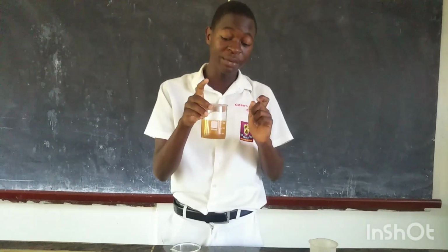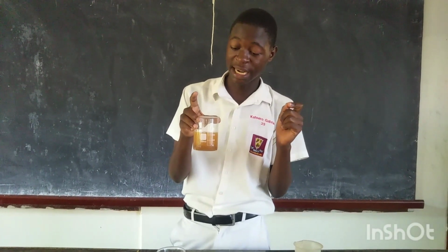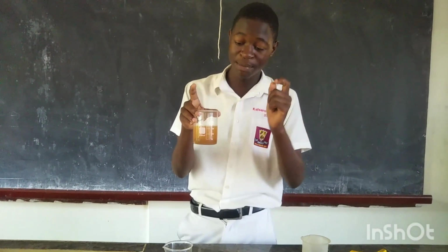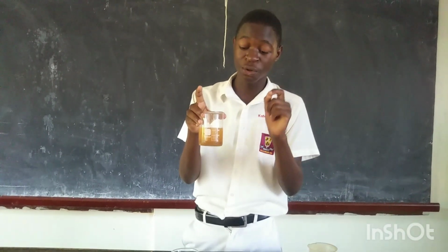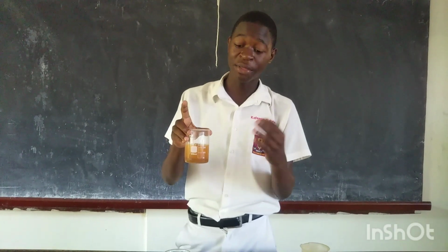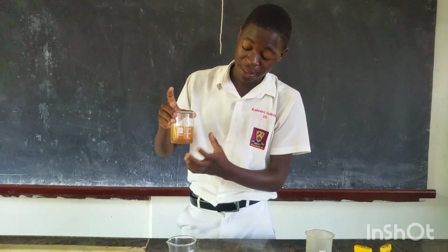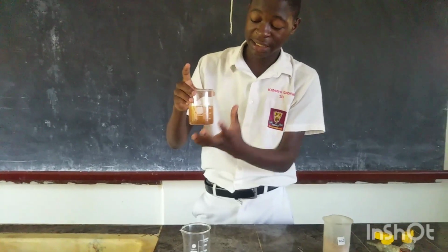So meaning that this sand contains tiny particles that have mixed uniformly with this water permanently. That's why the water has changed color. For it to return to its original color, that is, colorless, it may take much time, like 3 to 4 hours. But for the interest of time, as you see, the sand has just decanted.